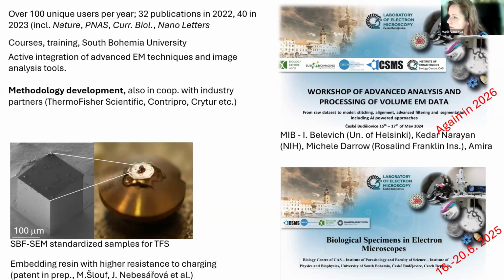So it encouraged us to organize the course again in the spring 2026. And this course will be just for more advanced users, and we will again focus on MIB, deep learning tools for image segmentation, and also probably this time with Empanada, because the participation accepted already again Elia Belevic from University of Helsinki, also Kedar Narayan and Michel Darrow. So it will be spring 2026.